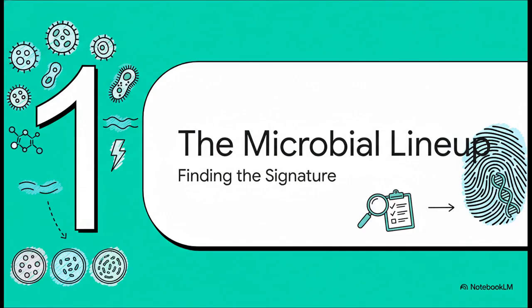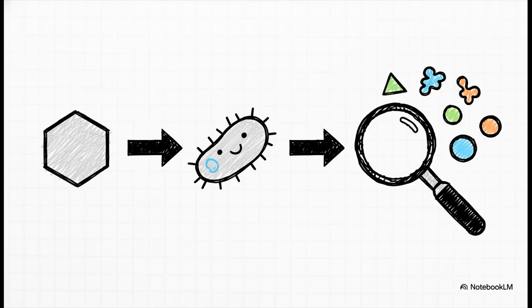Well, that's a clue. You start building a profile, and that profile is absolutely crucial. I mean, it's how doctors figure out the right antibiotic for an infection, or how investigators can trace the source of a foodborne illness. It's all about making that final positive ID. So you can almost think of us as forensic accountants for the microbial world. We're going to be tracking how different bacteria process carbohydrates, what they eat, and the chemical breadcrumbs they leave behind. This metabolic trail is exactly what sets one apart from another.